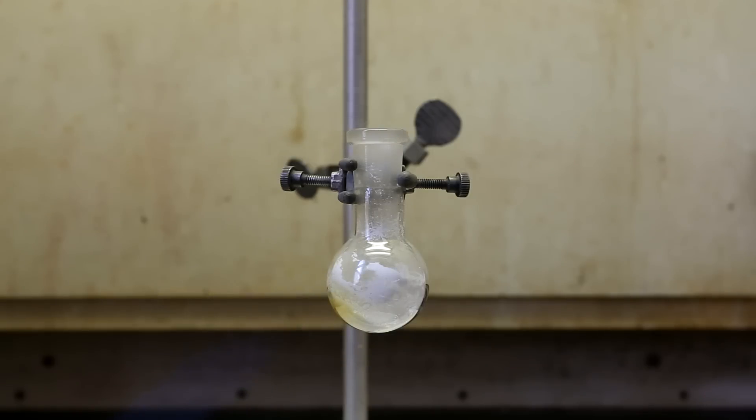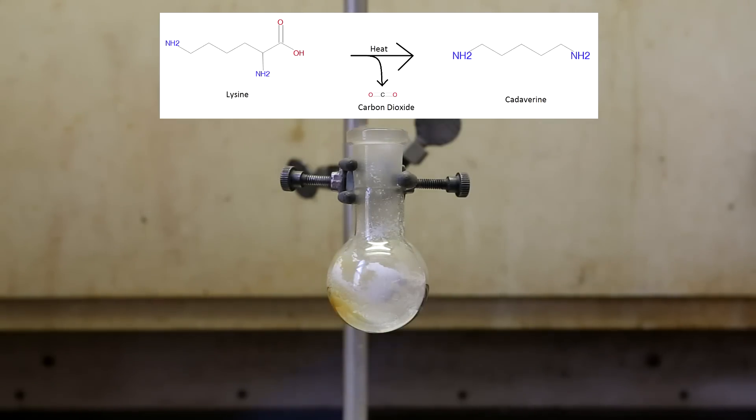The yellow color is the cadaverine oil that is forming. Cadaverine is formed from lysine by a decarboxylation reaction. Lysine is an amino acid and like all amino acids contains an amine group and a carboxylic acid group. These two groups logically give the name amino acid.